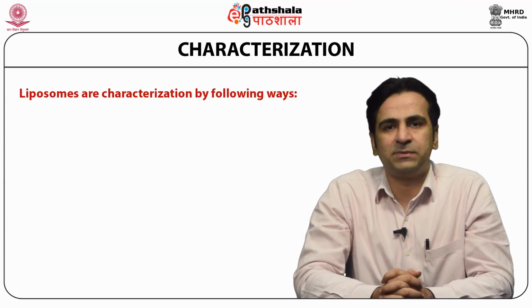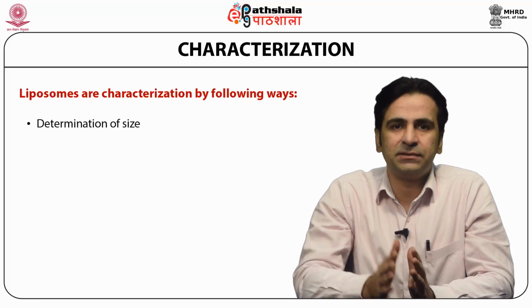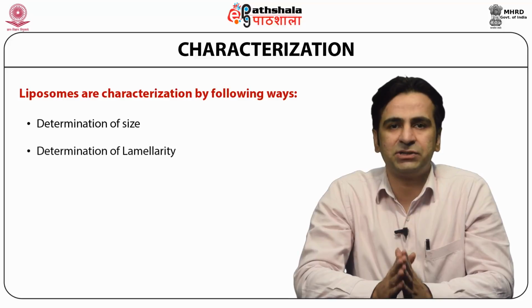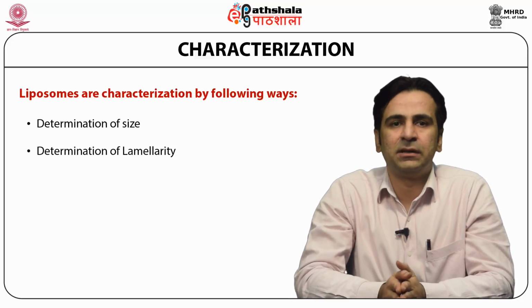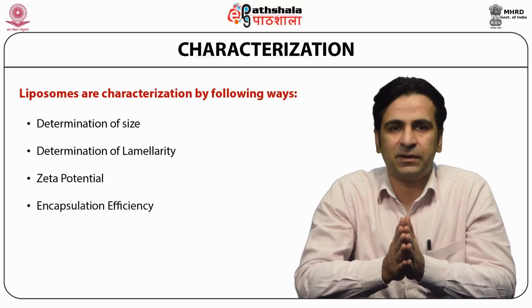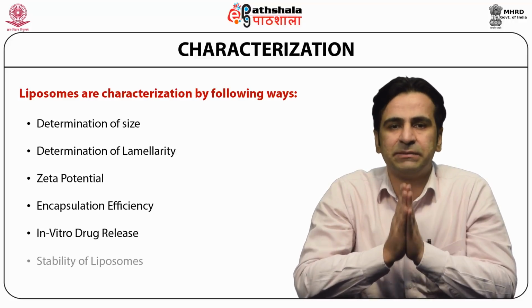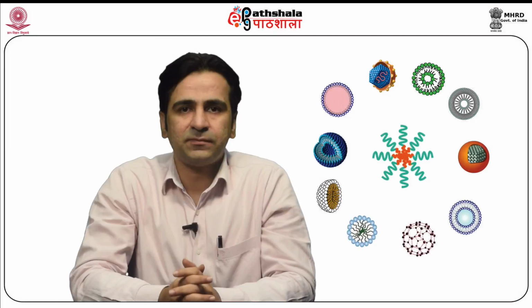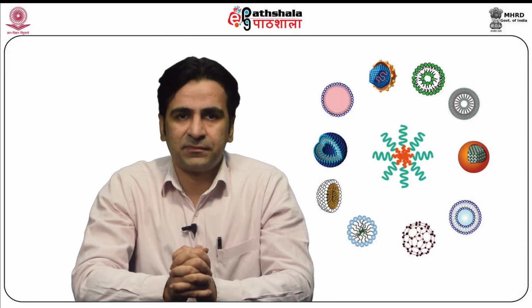Liposomes are characterized by the following ways, that is, number one, determination of size. Next, determination of lamellarity, that is the number of bilayers. Next is zeta potential. The fourth point is encapsulation efficiency. After that, in vitro drug release. And last, stability of the liposomes. Let's start first of all with the size determination.